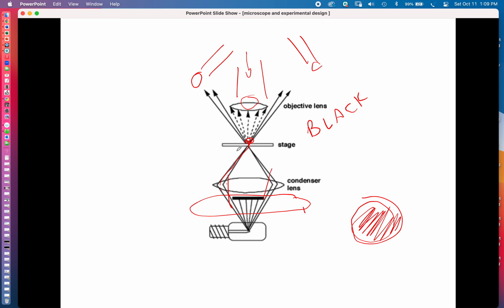And what happens is there is a sort of ring of light. So again, remember, this is a circle. If we look down at that filter, there's kind of like a ring or donut of light that's coming up, but see how it's coming around the edges. And so if it comes up and it doesn't hit the specimen, it misses the objective lens. And this is a reason why the condenser needs to be focused up and down just right for these different kinds of light microscopy where there is a filter, because we've got to get this just right.